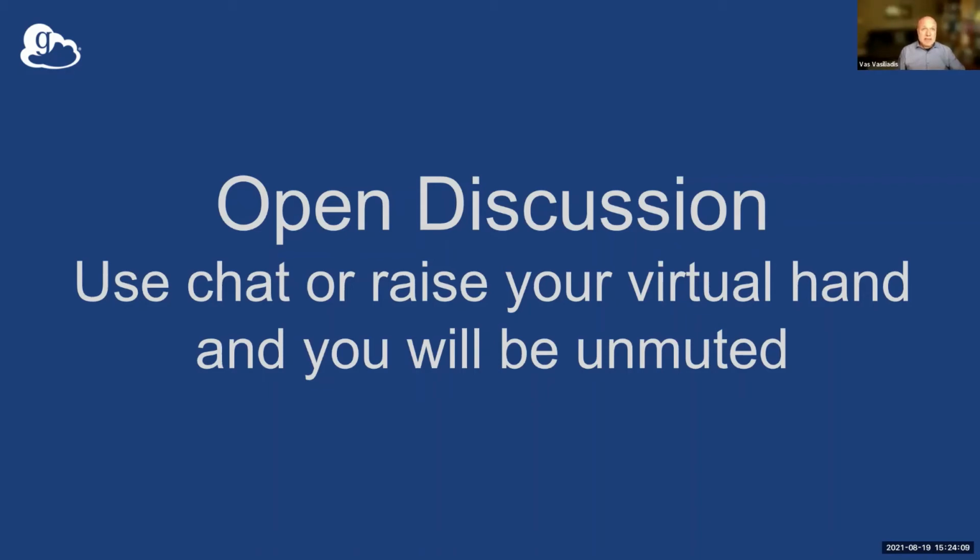So if I interpret that in a more concrete way, I'm working with, I don't know whether you're aware of imaging databases like OMERO or whatever. I'm just wondering whether you can have the data actually reside in different institutes, but have one server to visualize it through different sites on different data sets.